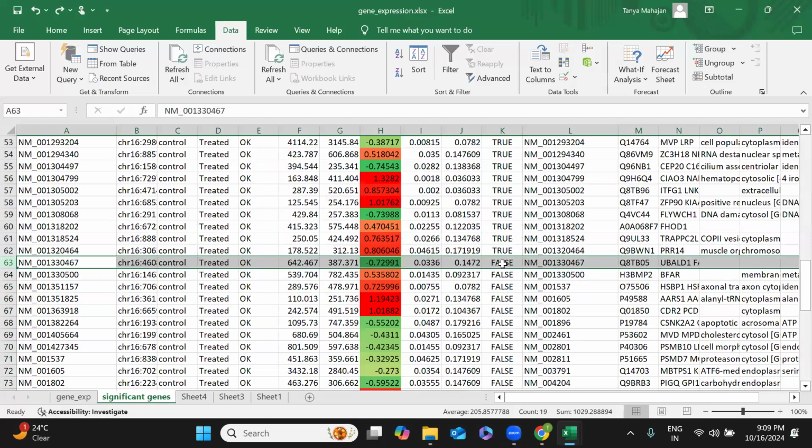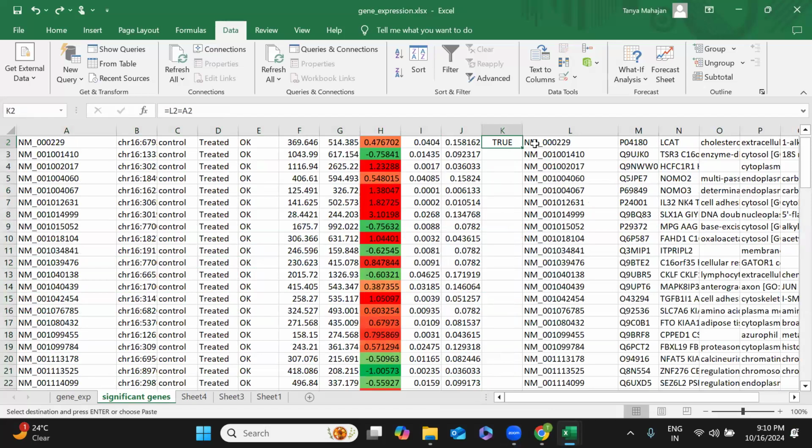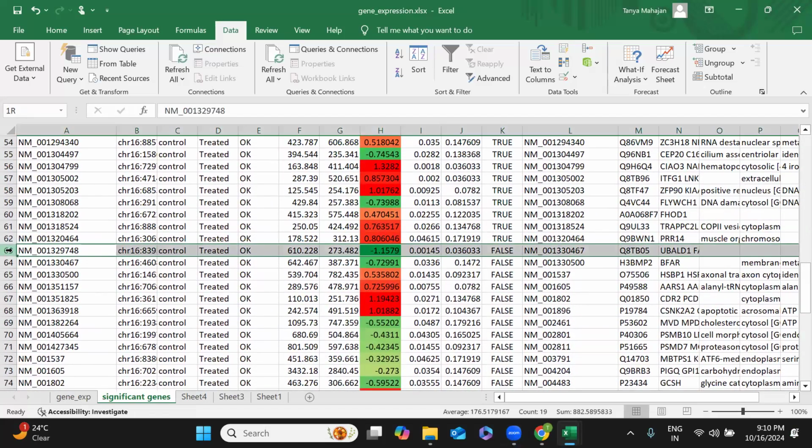So here you are getting a false entry, right? This one, right, Imran? So 748 is not matching with our data, but we cannot lose our data, correct?